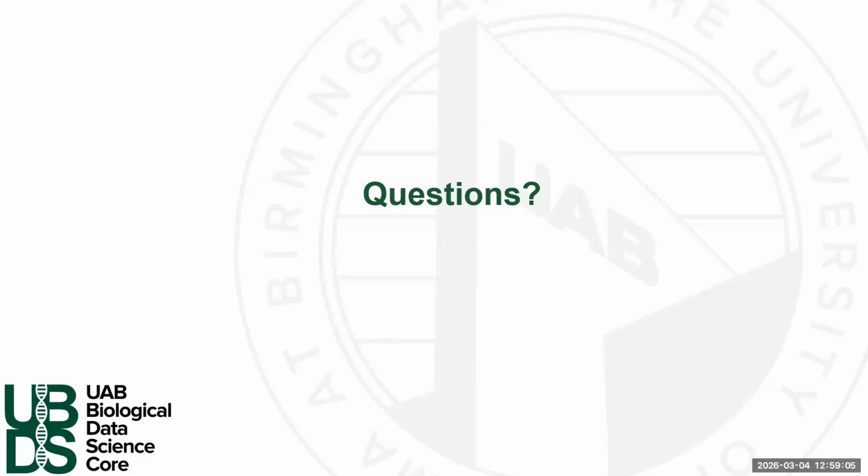Okay, yeah, that's a great question. Right now, at least for the roadmap of scnanoseq, we don't have PacBio. We don't have PacBio on the roadmap, but it is something on my mind. A lot of these tools, though, do support PacBio. So I do think that with time, it wouldn't be as much effort to actually enable PacBio data. So I'm waiting a little bit to see, can we let the tools do some of the heavy lifting for us and then simply enable that type of data in the workflow?